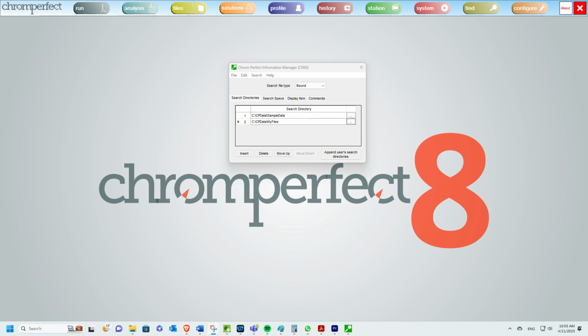Pre-existing paths will not be duplicated. To add a new path, select a row in the spreadsheet, if there is one, and press the Insert button. A new row will appear after the selected row. To delete an existing path, select a row in the spreadsheet and press the Delete button. The selected row will vanish.